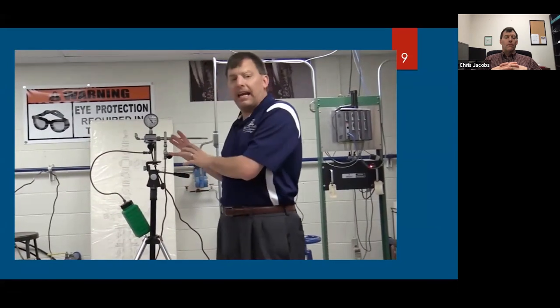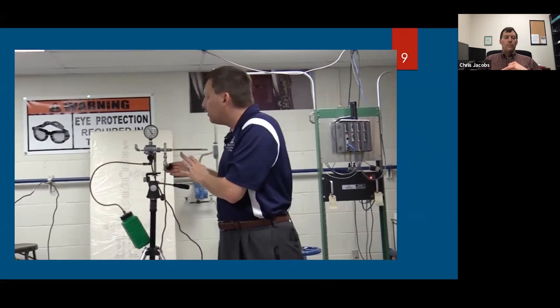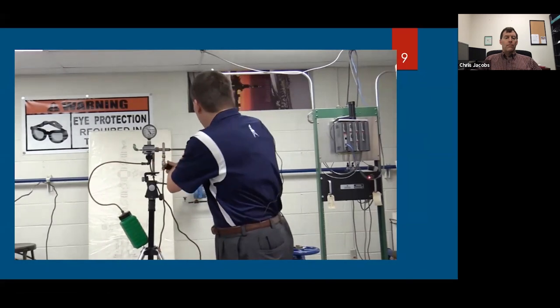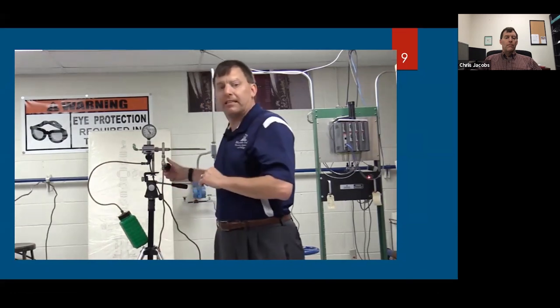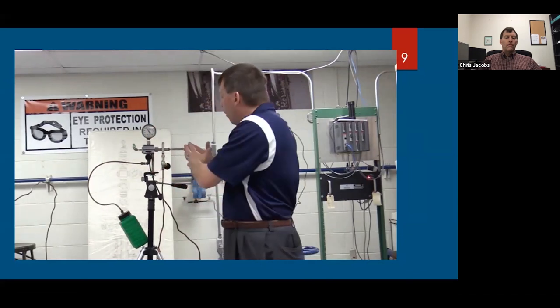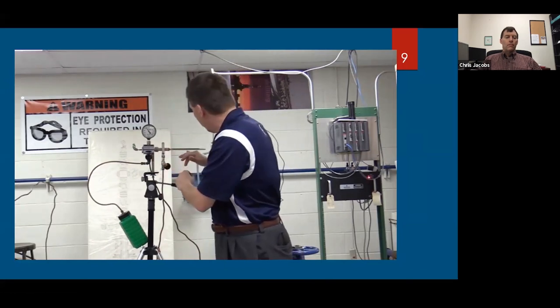Now, one thing I will say is if you have an idea approximately what your dew point temperature is, you can open the CO2 valve and leave it open for more than half a second. But again, don't overshoot your temperature. Okay, now the last droplet is gone, and I have a temperature of 61 degrees. So I'm willing to say that at this temperature, at this pressure of about 70 PSI, the dew point of the water vapor in this air sample is about 61 degrees Fahrenheit.